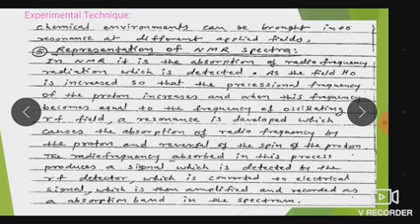In NMR, it is the absorption of the radio frequency radiation which is detected as the field H0 is increased, so that the precessional frequency, the top-like rotating frequency of the proton, increases. When this frequency becomes equal to the frequency of the oscillating RF field, resonance is developed.